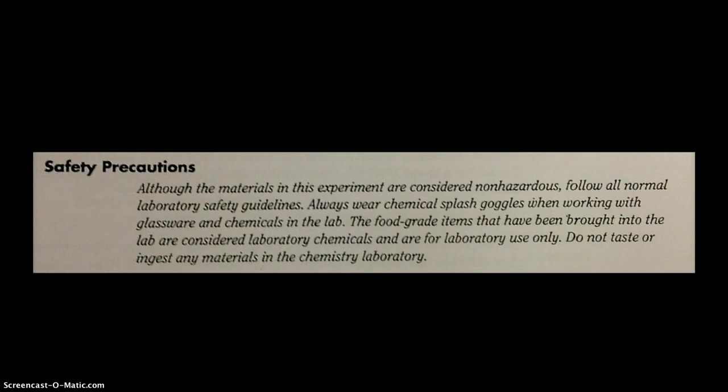Although the materials in this experiment are considered non-hazardous, follow all normal laboratory safety guidelines. Always wear chemical splash goggles when working with glassware and chemicals in the lab. The food-grade items that have been brought into the lab are considered laboratory chemicals and are for laboratory use only. Do not taste or ingest any materials in the chemistry laboratory.